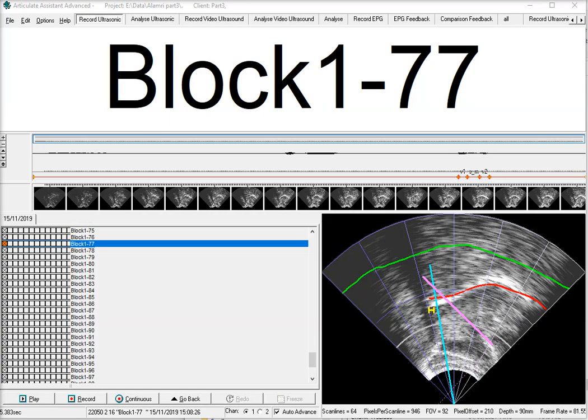On this project with 200 recordings, it took about 45 minutes to apply all these splines. So here we can see one of the recordings with the cyan and pink fiducials. Now if you're not happy with the position of these fiducials, you can reprocess. Again, you just need to adjust the position of the fiducials and correct the position. Save them into a template, either a new template or overwrite the one you just used, and then run the batch processing again.